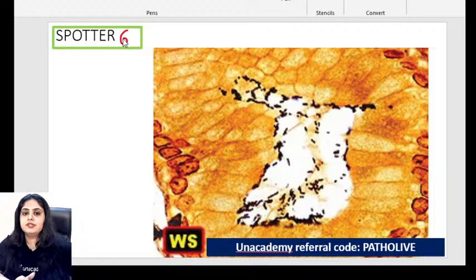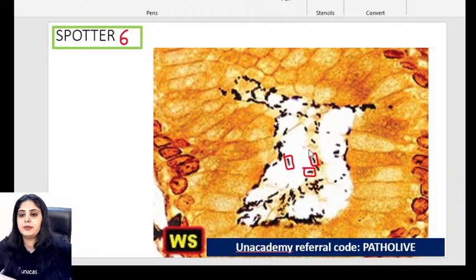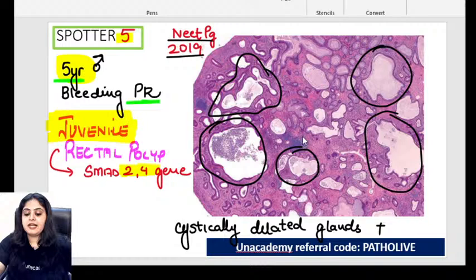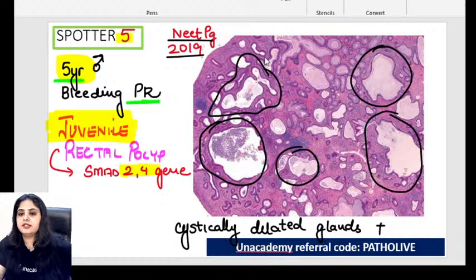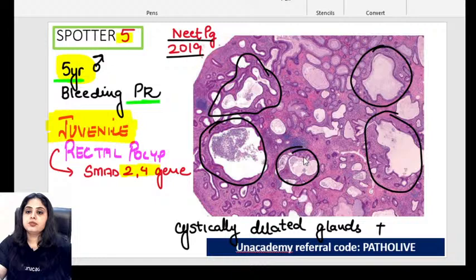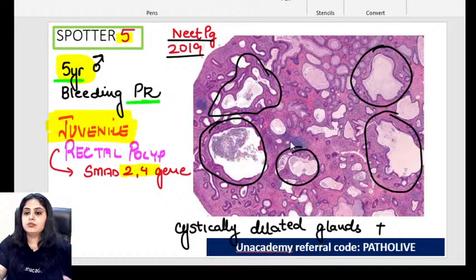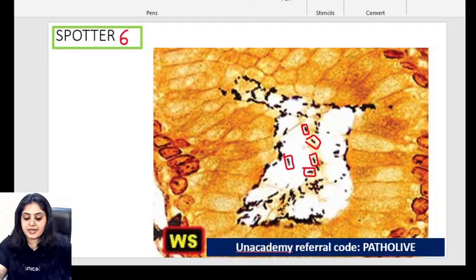Spotter number six — for second-year students. There are black rod-shaped organisms visible. Before giving the history, what's your analysis? I got various answers: adenoid cystic, cribriform, some said round glands, some called them tubules. Without history, at least you were analyzing the slide — you could identify round glands, cribriform spaces, or tubules. That kind of pathology slide analysis is exactly right.